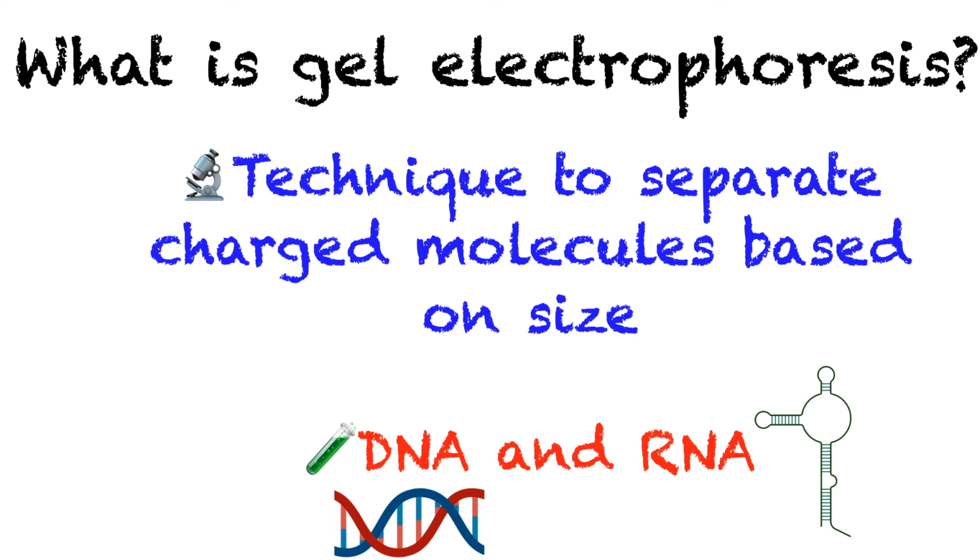And in biotechnology, in most cases, the charged molecule would be DNA or RNA, because biotechnology deals more and more with these particles, DNA or RNA. I would like to say molecule, rather. And this technique, the gel electrophoresis tool, consists of two different things.